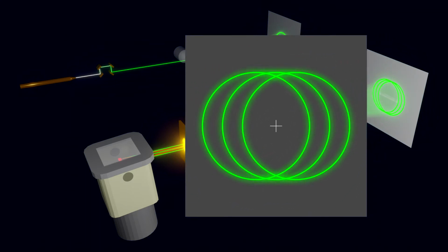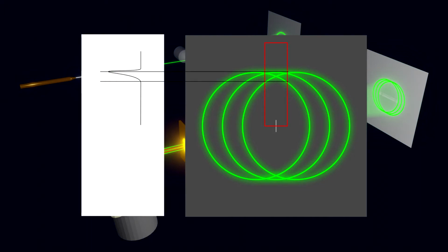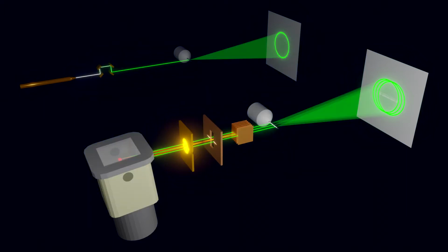Now when our detector scans from the center out, it will start detecting the off-center curved parts of the diffraction rings before it reaches the centered ring segment. And after reaching the maximum, the intensity falls off sharply. The resulting peak shape is strongly asymmetric. We can reduce the curvature of the diffraction rings reaching the detector by inserting another Soller slit in the secondary beam.